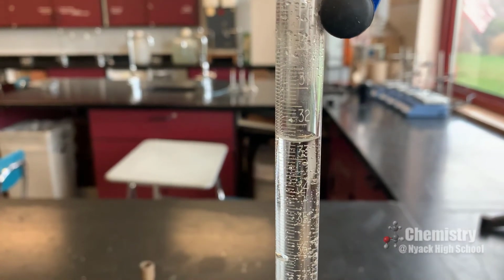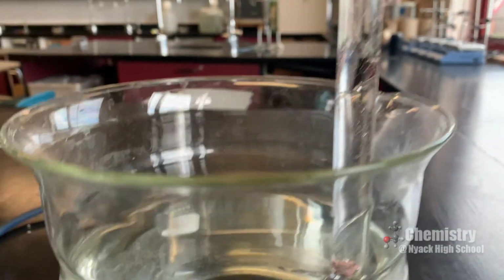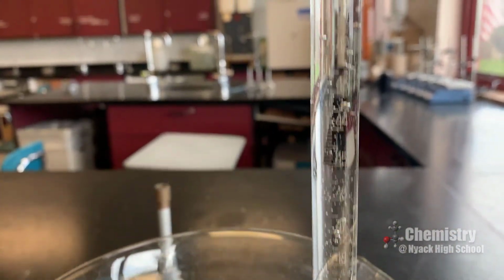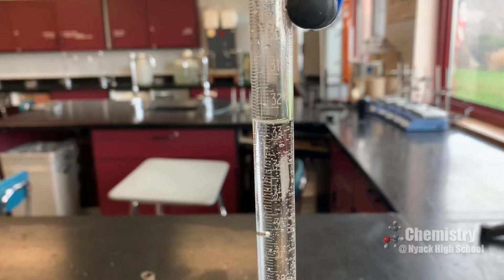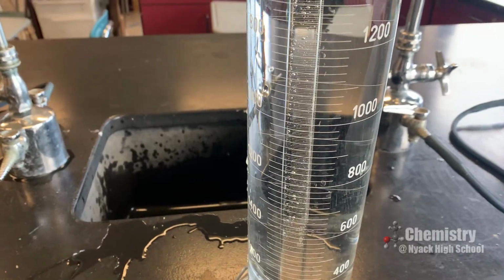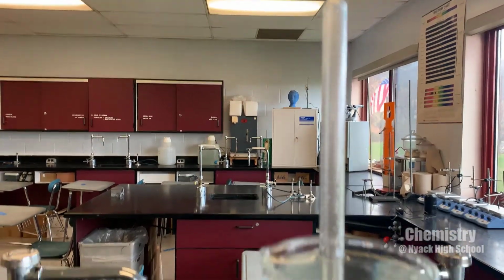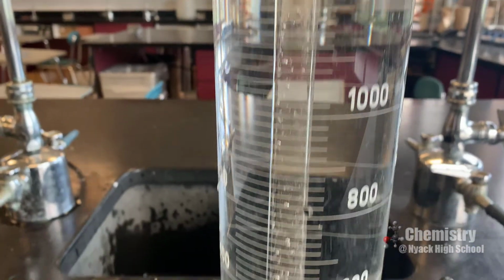Okay, notice that the reaction has stopped. The magnesium strip is completely consumed. And at this point, I'm going to take the eudiometer out and place it into another graduated cylinder so that I can measure the volume of the hydrogen gas collected. Okay, so I've taken the eudiometer out of its setup and I've placed it into a graduated cylinder filled with water.